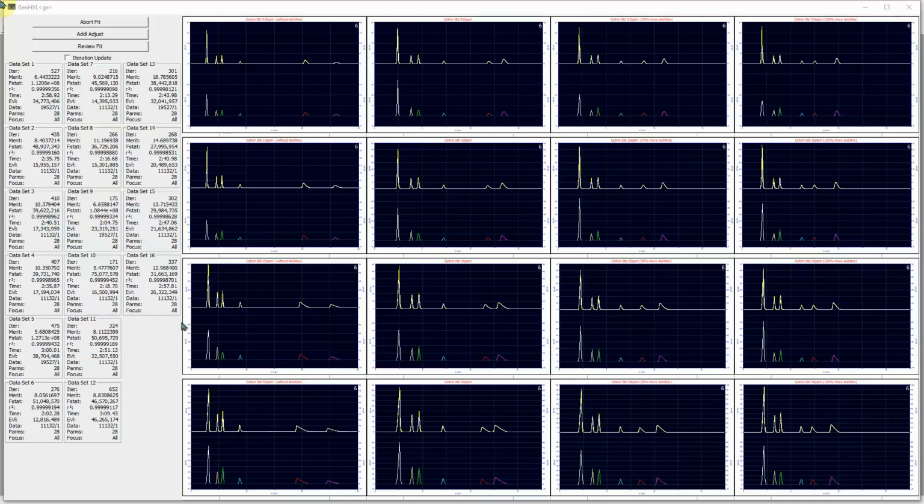As a reference point, fits to a pure HVL model will vary, for this data, between 2100 and about 4600 parts per million error. Just these 4 additional parameters, 1 asymmetry parameter shared across all of the peaks, 3 IRF parameters also shared across all the peaks, make this profound a difference in the accuracy of the fitting.